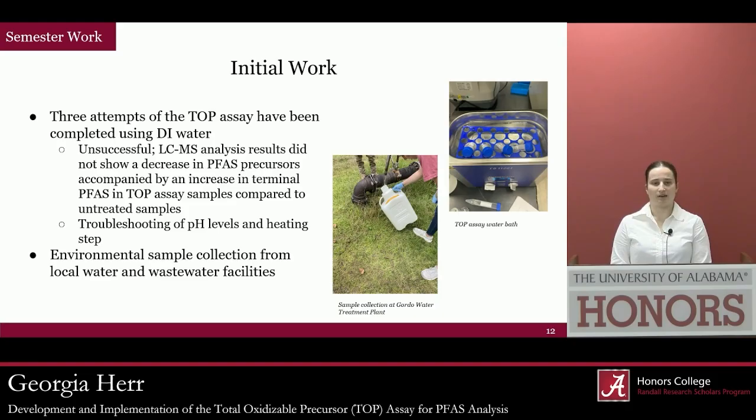Secondly, we've collected environmental samples from local water and wastewater facilities in the Tuscaloosa area to hopefully apply this TOP assay method to once we are able to get it successfully working with deionized water.